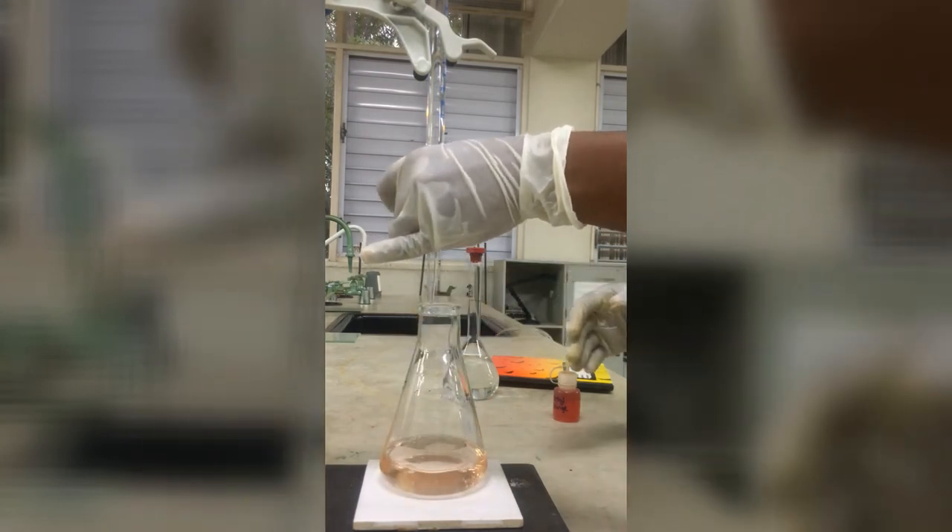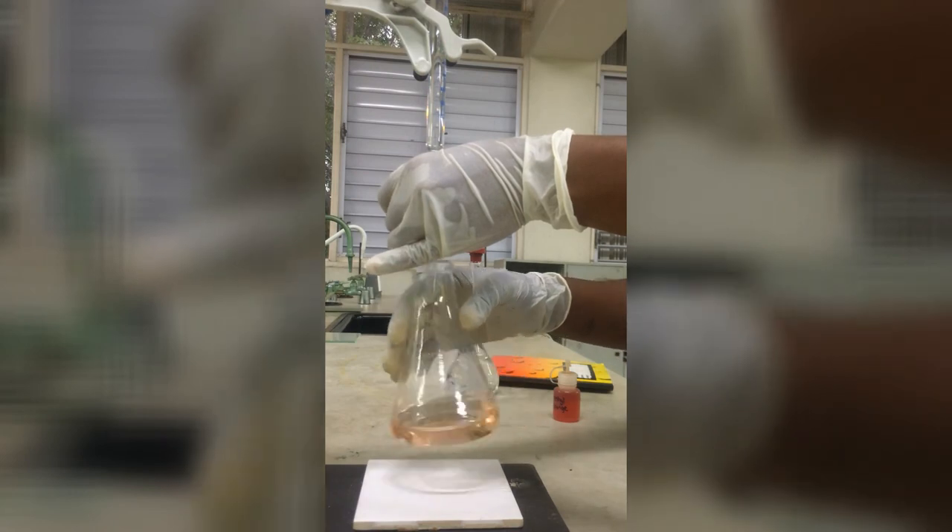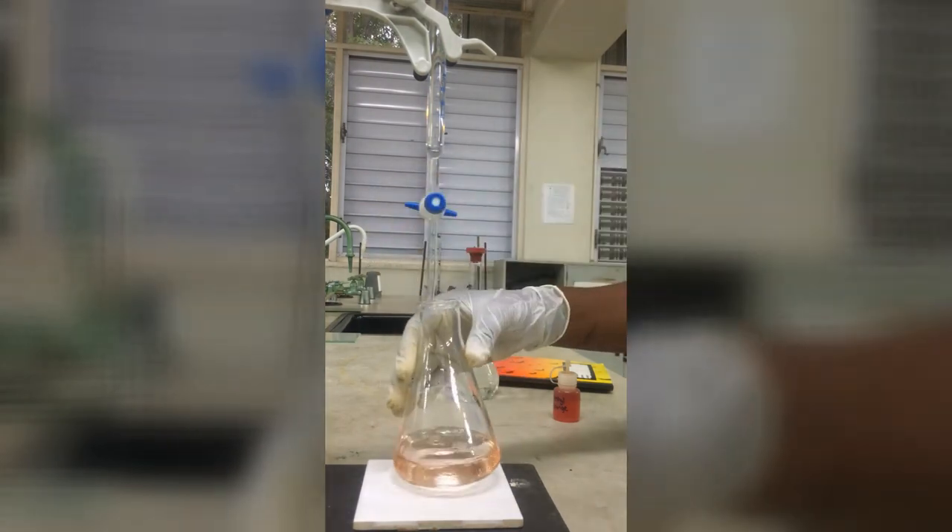After we have achieved the color change, we take our final reading, and of course we do this between the drips.